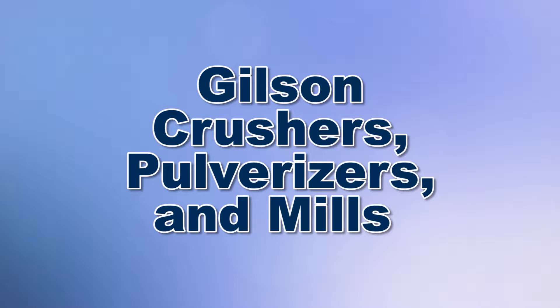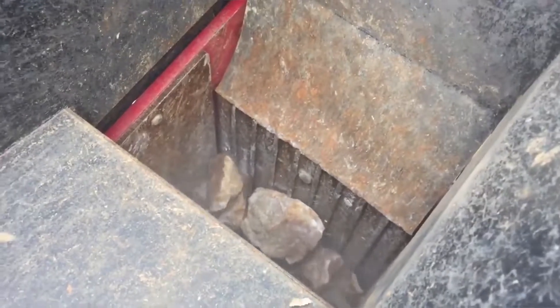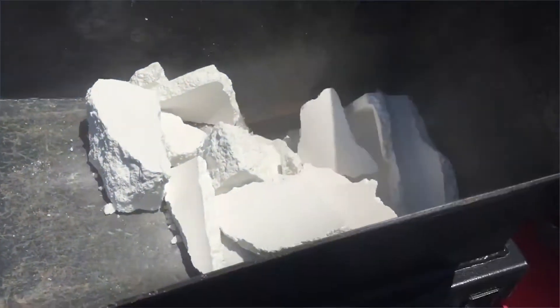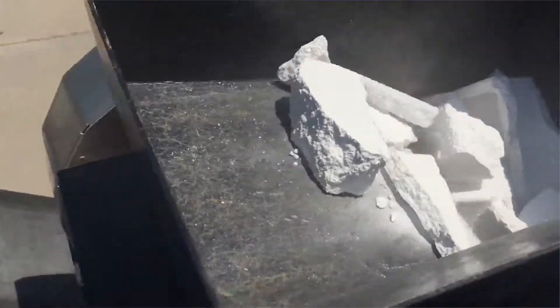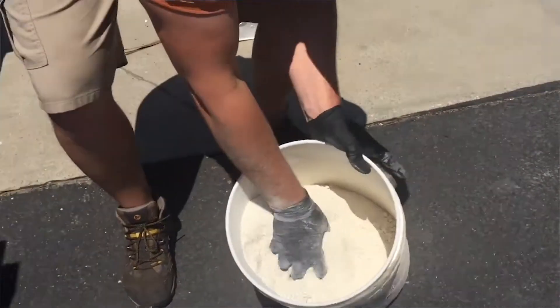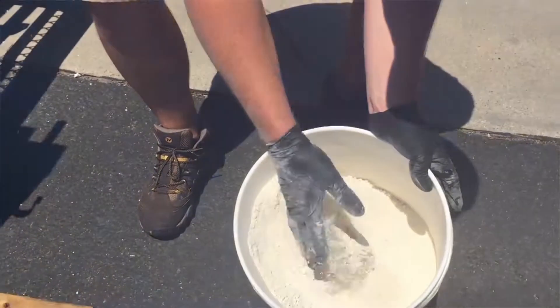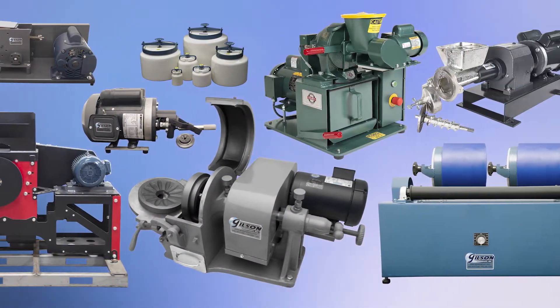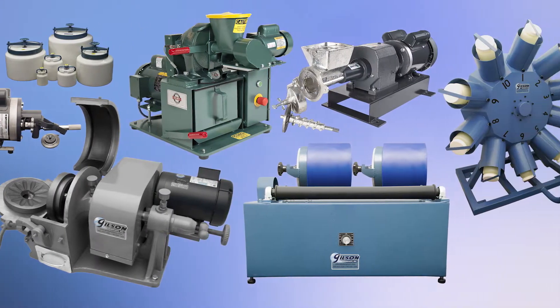When you need particle size reduction of bulk material in preparation for testing, Gilson is your best choice. Proper sample preparation for many materials may require careful and thorough particle size reduction for accurate and reliable test results. Gilson has everything you need for your laboratory crushing, grinding, pulverizing, and milling needs.